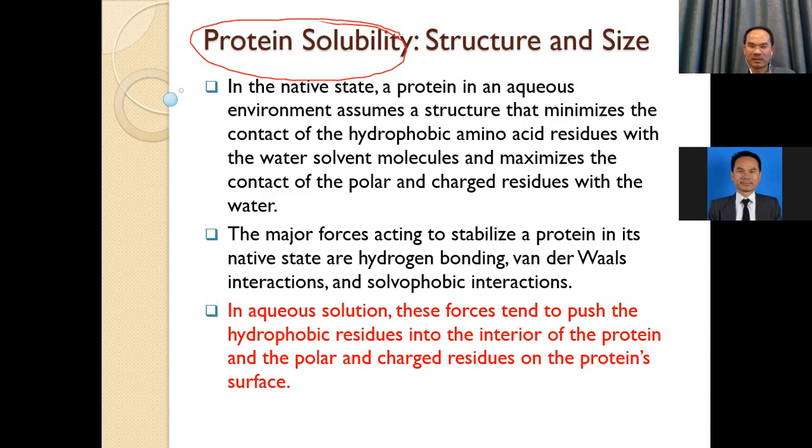How to reduce the solubility? You can add some precipitating agent like this.